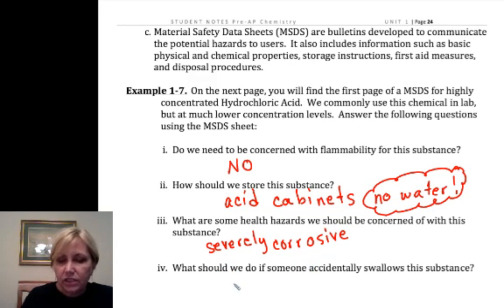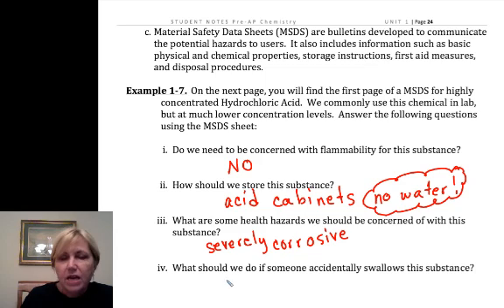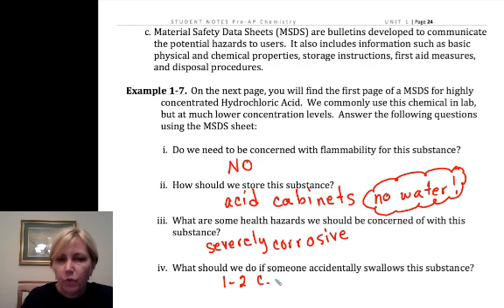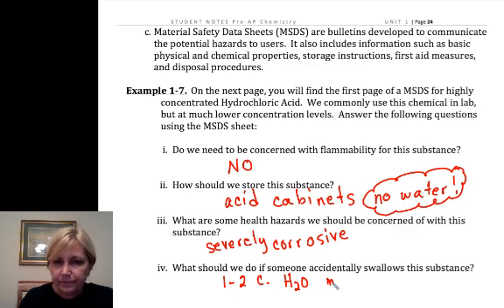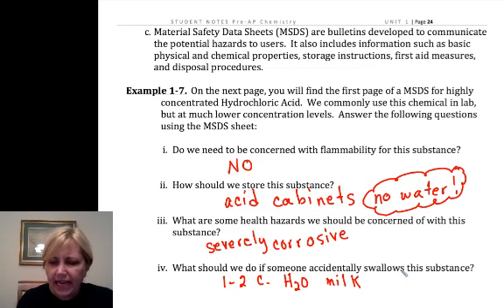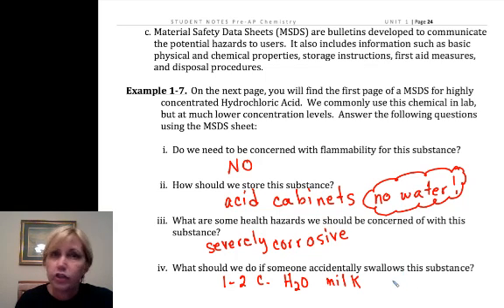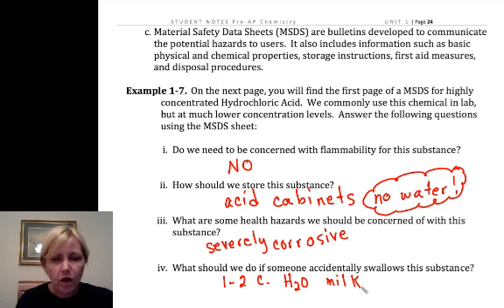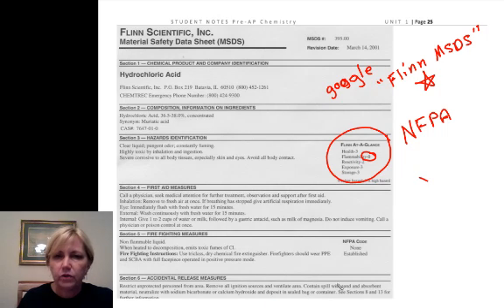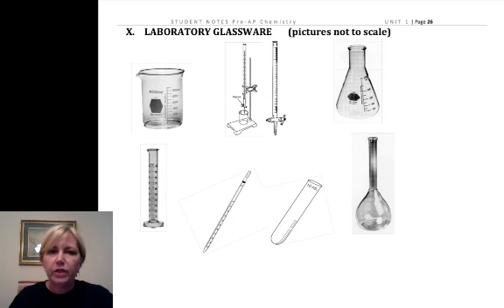What do we do if you accidentally swallow it? I keep MSDS sheets and we can look them up in a heartbeat. You'd want to drink one to two cups of water or milk. There's a little saying: 'Johnny was a chemist, but Johnny is no more — what Johnny thought was H2O was H2SO4.' So we don't want to drink acid. We'll call poison control and take good care of you. Just be very careful in the lab and we won't have to worry about it.